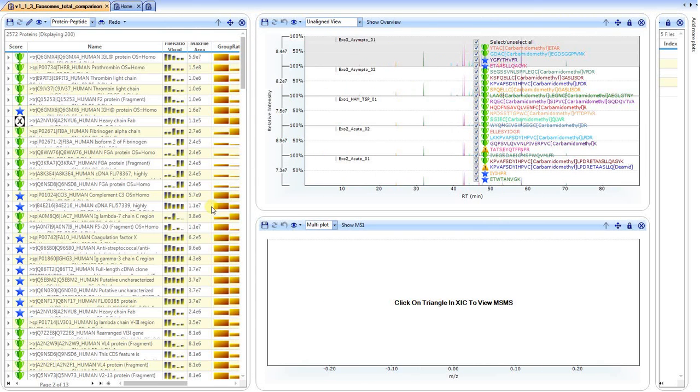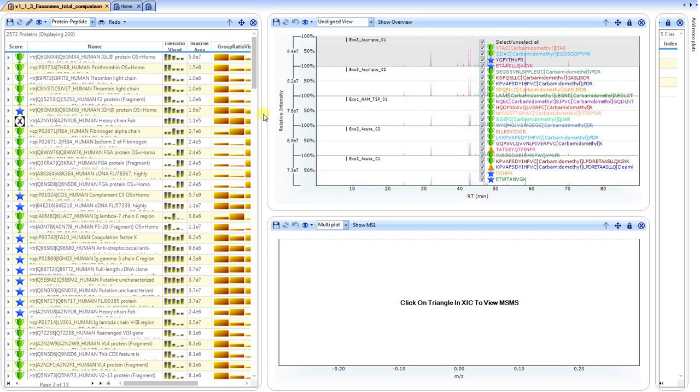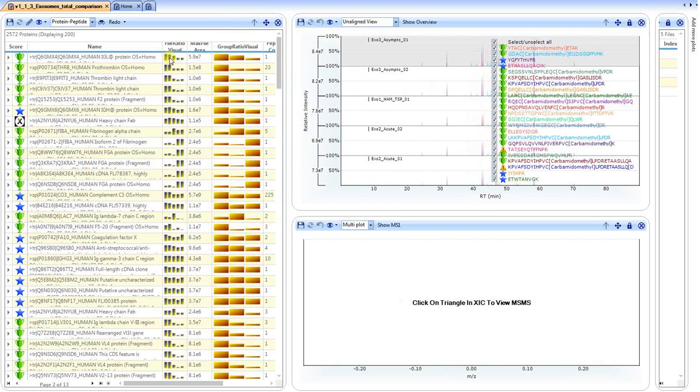And so once you've processed the data, you have this particular layout, which is the results table showing a comprehensive overview of all results. So you don't have to pick and choose which protein to look at specific results. You get everything in this particular table. You have a chromatographic view, and then you have a mass spectrum view that you can look at either the MS or the MS2. And as the default layout that you can set up simply showcases both a gel view, which is shown here, from the file.